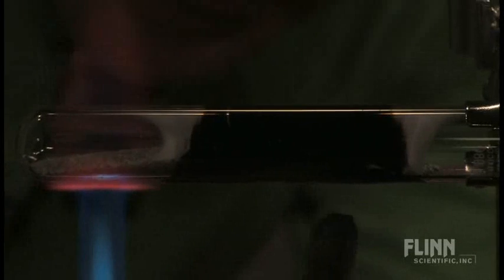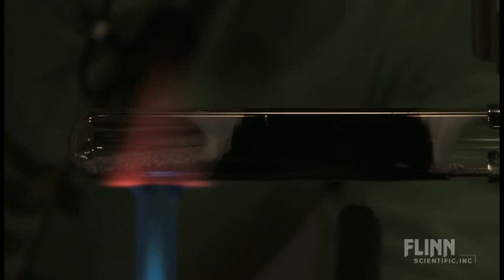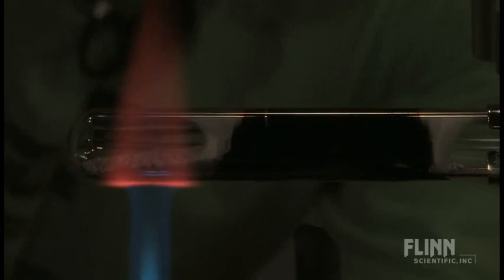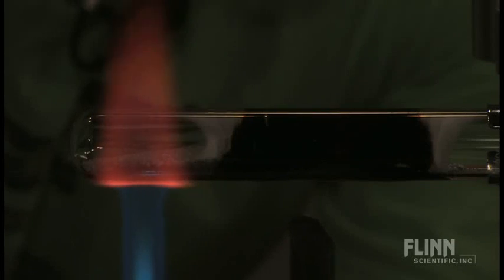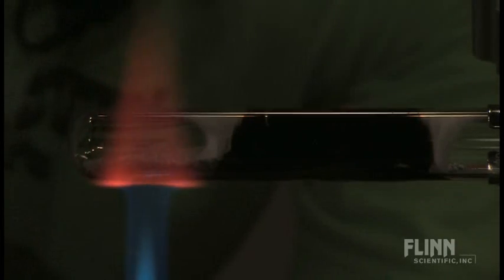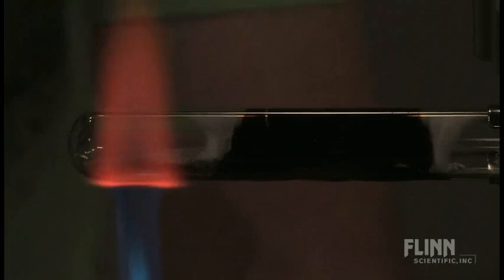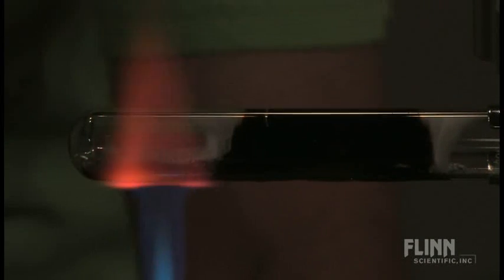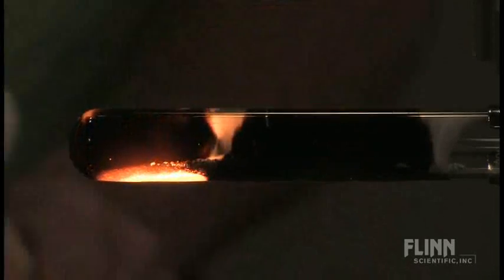And also, you can maybe just pick out the fact that the shape of the test tube has started to change. I've actually done this. The first time I did it, I didn't do it in a hard glass test tube, and the bottom of the test tube just melted right out. Stuff just fell out on the tabletop. I'm going to finish this reaction off so I've got the whole thing. I didn't heat the back of it quite enough, so we'll finish this up real fast. There it goes. So we've got the whole thing.